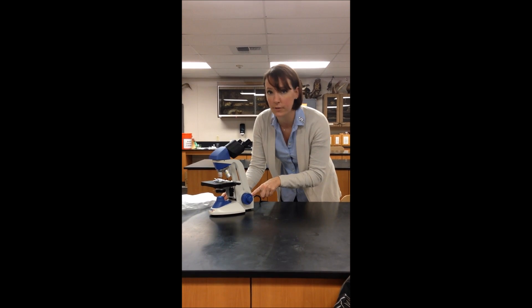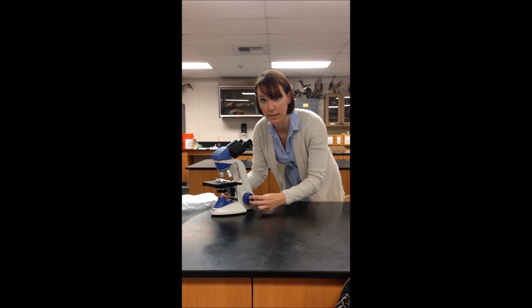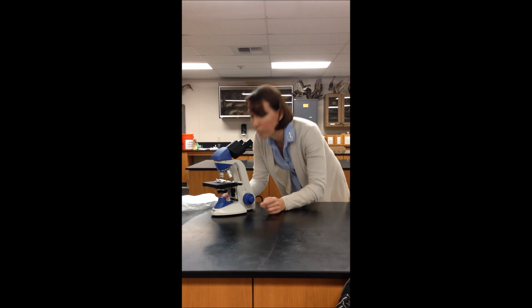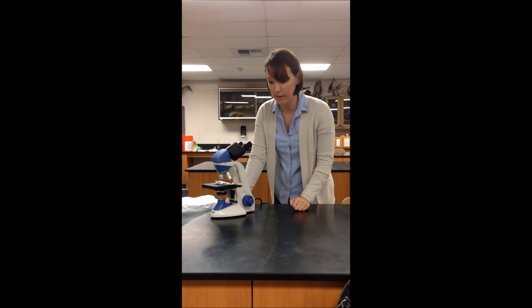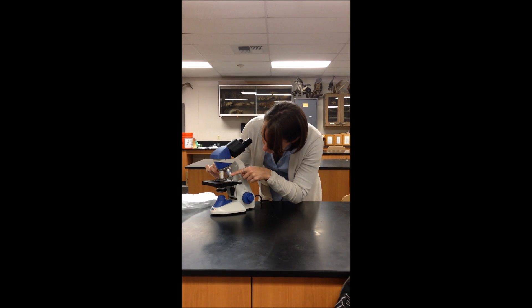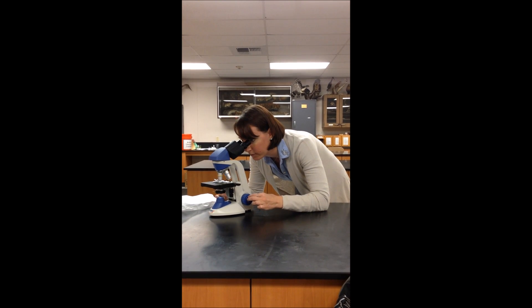Once I can see my image under the microscope by using the coarse focus, I will use the fine focus, this small knob, in order to make the image clear. Once I have a clear image through the eyepieces using my fine focus, I can move up to the 10x, making sure I pay attention that the slide and the objective are not coming into contact with one another. Then I use only the fine focus to make the image sharper.